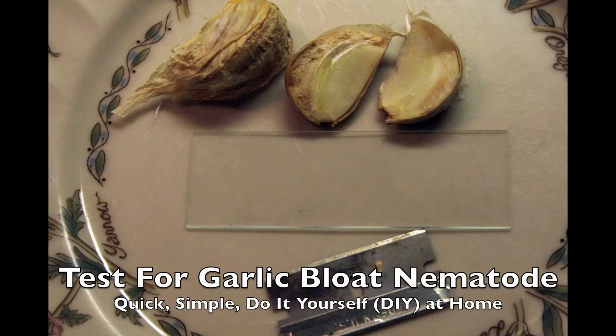This is a do-it-yourself test for the presence of garlic bloat nematode, or stem and bulb nematode. In the UK they call it onion eelworm, in your seed garlic or in garlic you're going to use from someone else. It's a big problem right now in the US, and most people say you need a university lab test, but you can do it at home.